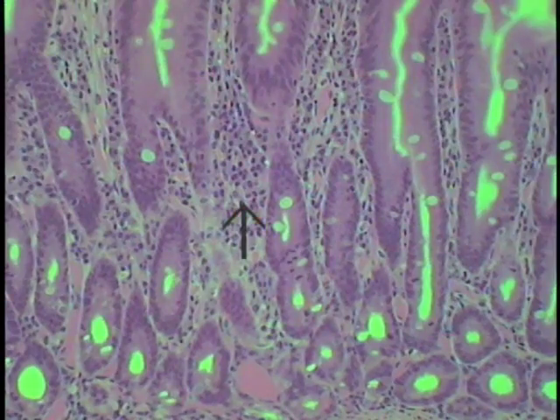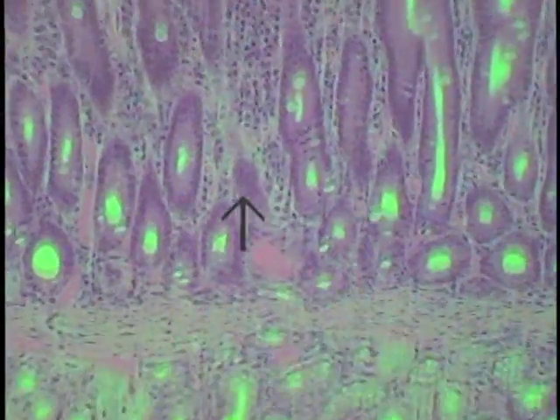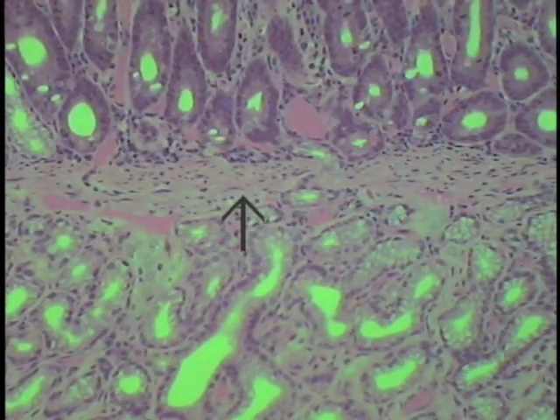So this lamina propria is a complete sleeve of this gut-associated lymphatic tissue that fills the core of the villi and surrounds the intestinal glands. It begins higher up, but is particularly prominent in the intestinal tract and in the colon, where it will form a three-dimensional sleeve all the way around the lumen from the beginning to the end of this particular tube. So it's a pretty elaborate and extensive structure, this gut-associated lymphatic tissue. Now, if we continue on, we can see the muscularis mucosae as indicated by the arrow, and then, of course, Brunner's glands in the submucosal area.